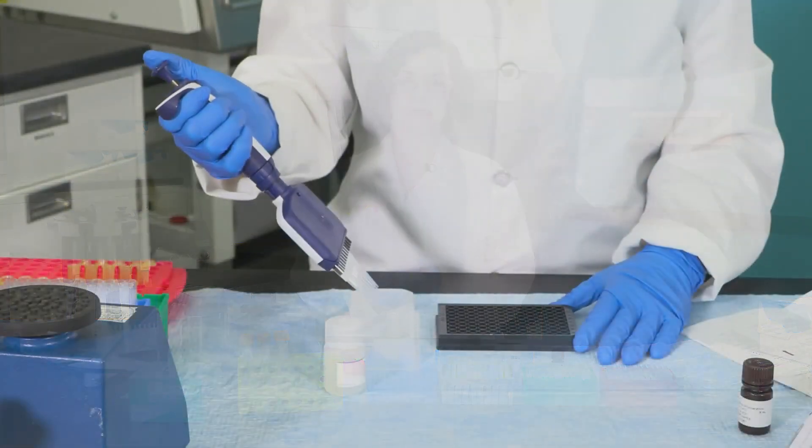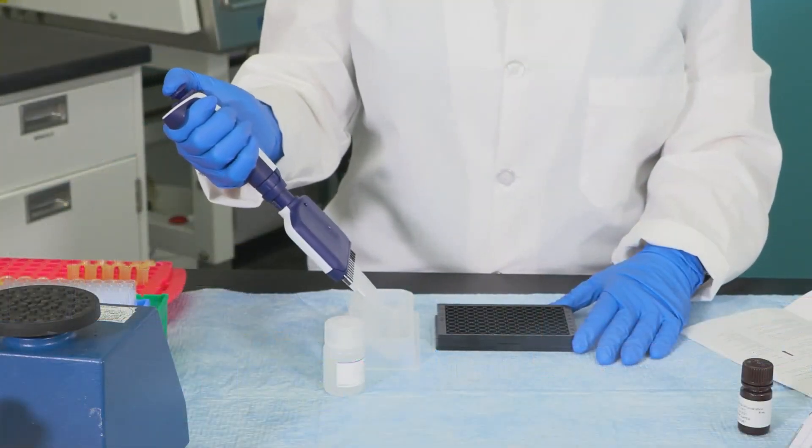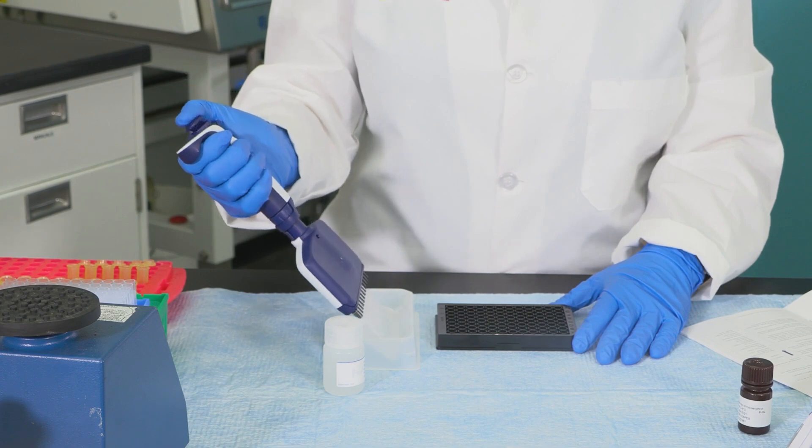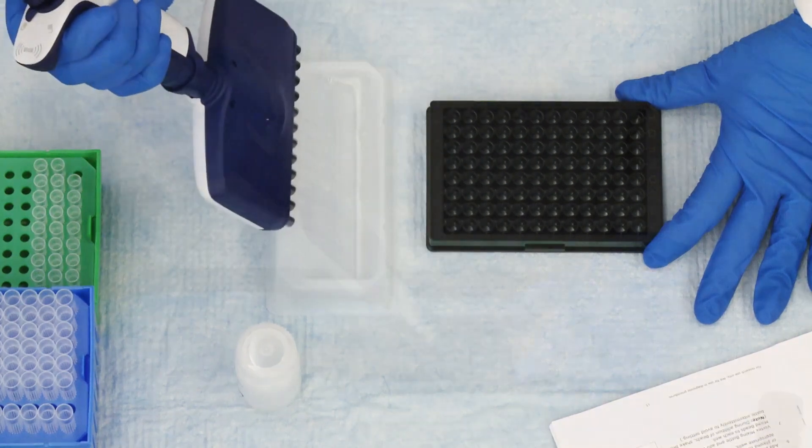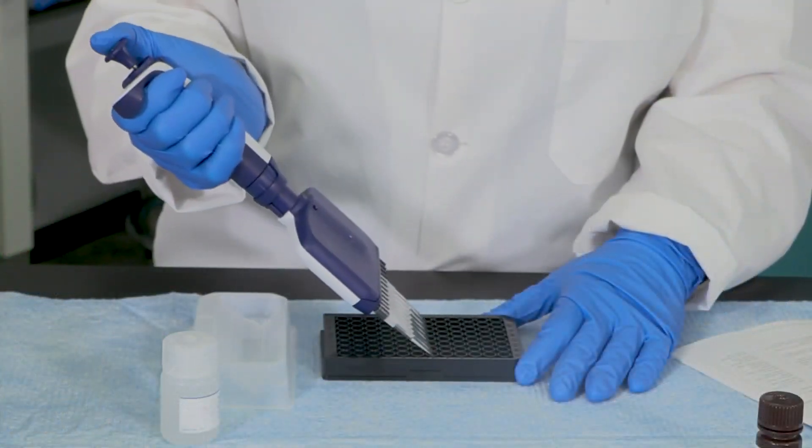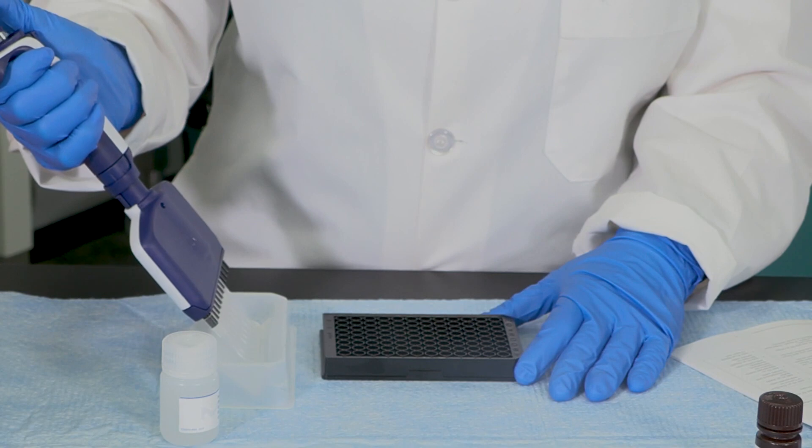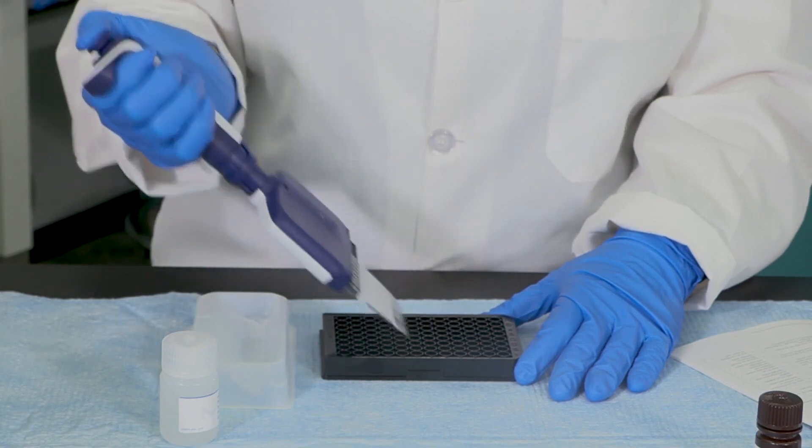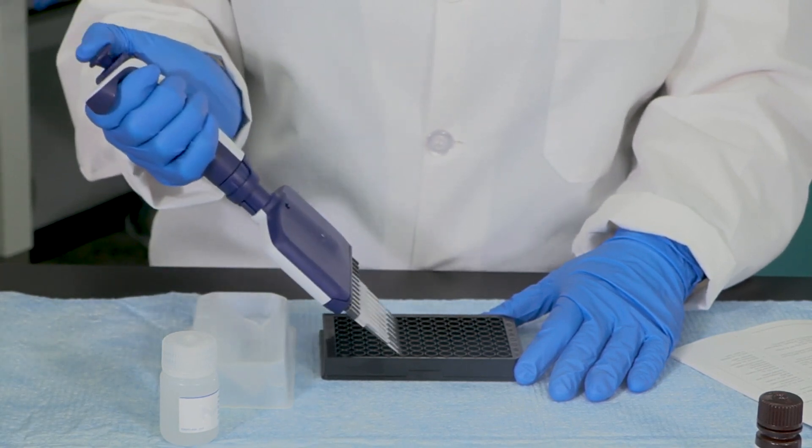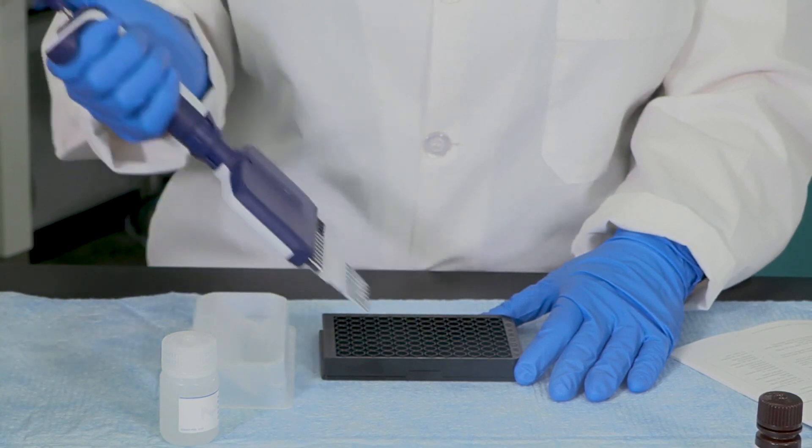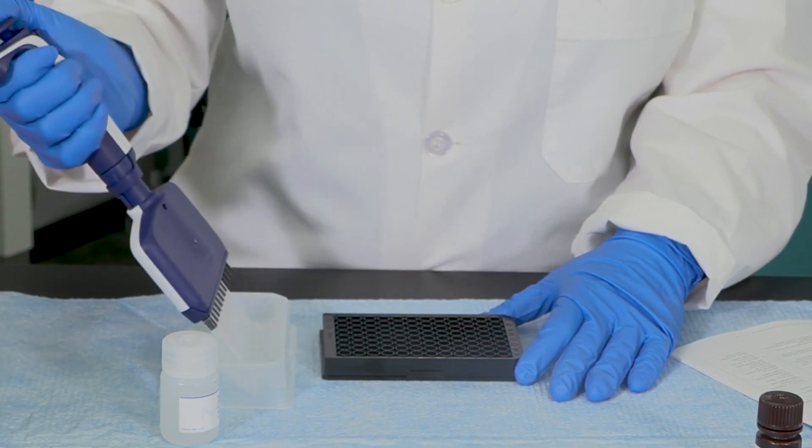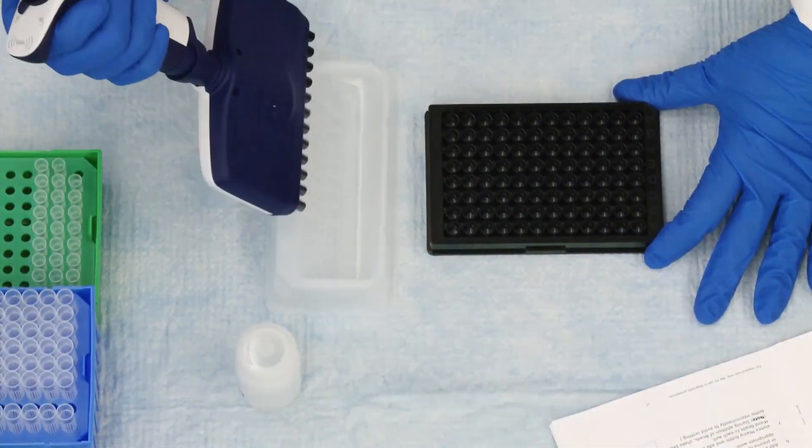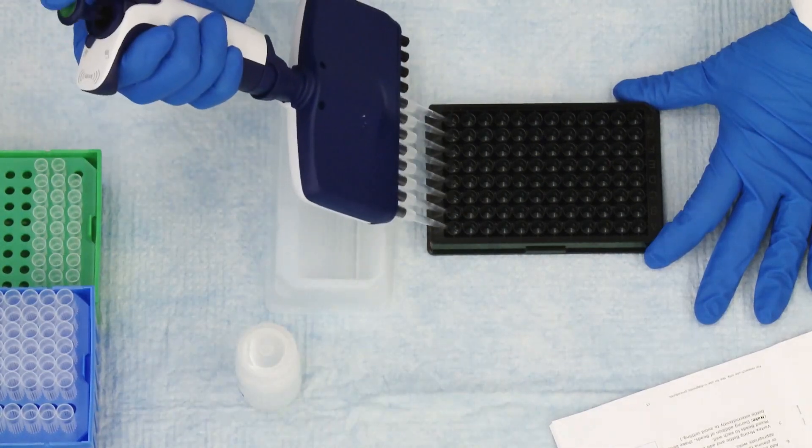Use reverse pipetting for more accurate dispensing. Begin by depressing the plunger past stop one and aspirate the liquid. To dispense the liquid, touch the tip against the well wall and push the plunger only to the first stop to dispense the intended volume. Do not go past the first stop, as the residual liquid in the tip is the difference between the original aspirated volume and the desired volume required in the well. From there, the same sequence can be used to aspirate and deliver liquid to additional wells using the same set of pipette tips.